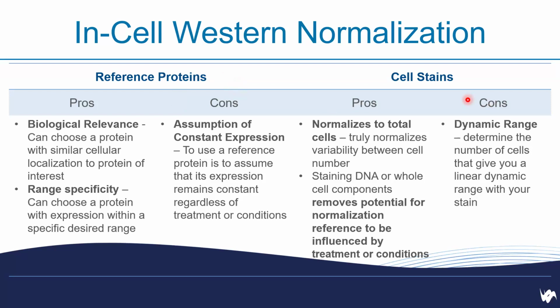normalization control, there will normally be your cell staining, either a DNA stain, or intracellular cytoplasmic staining, or total cell staining. So you are staining the entire cells, and that serves as your normalization control. The good thing here is it actually normalizes the changes of the cell conditions, either they are dead because of the treatment or so on. Okay, it normalizes against that. So it's rather more consistent, but it has a much shorter dynamic range.